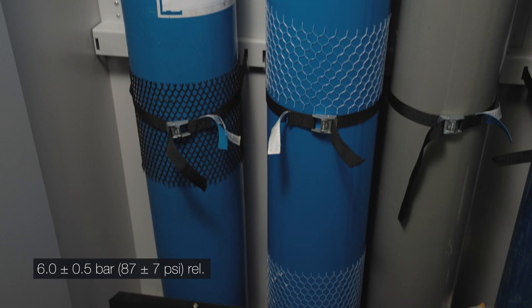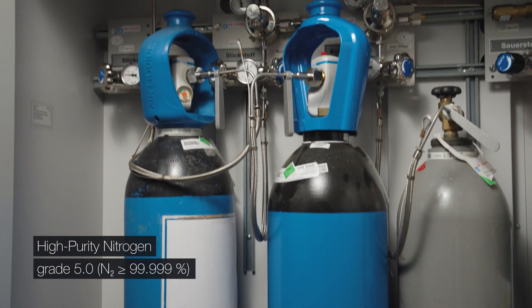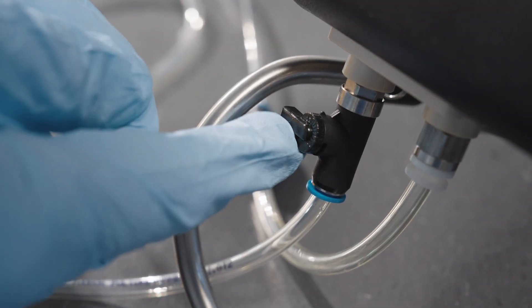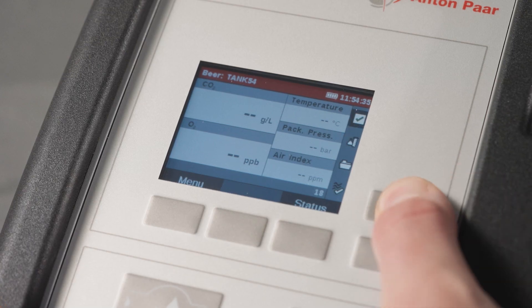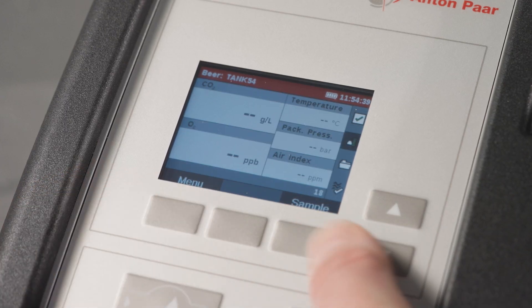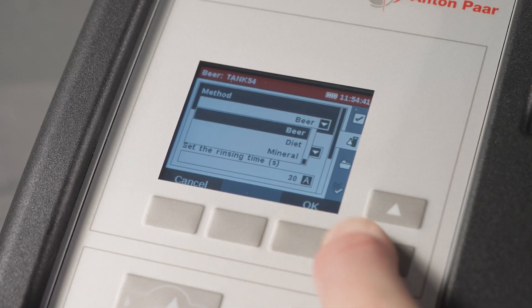Use nitrogen gas, minimum class 5, for oxygen measurements. Ensure the ball valve is closed. Check the instrument status and confirm that the correct method, sample ID, and units are set.